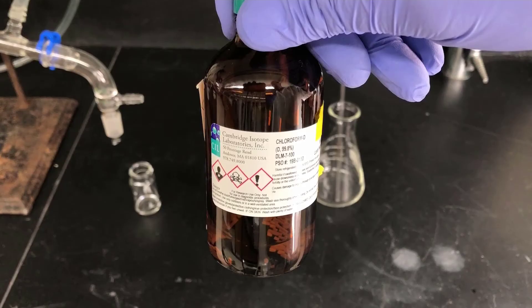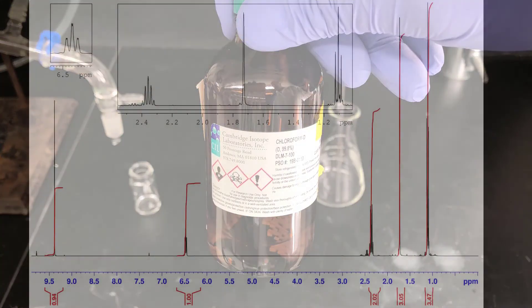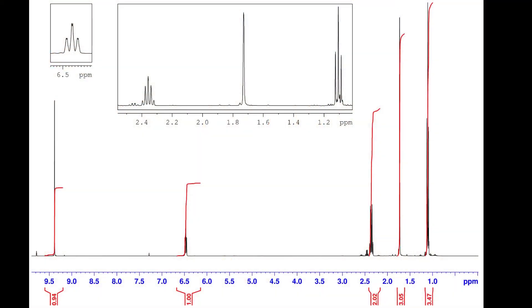Finally, I'll prepare a sample for proton NMR analysis by syringing in 0.6 milliliters of deuterochloroform into an NMR tube, then adding one drop of my product mixture, capping the tube, inverting it a couple of times, and writing my initials at the top in a Sharpie marker. Your NMR data will be acquired and sent to you by email, either as a PDF file or as a raw data file that you need to process in Bruker's TopSpin NMR processing program. Here's a high resolution image of a proton NMR spectrum of the product. You should interpret the peaks by drawing the structure of the product, showing all the protons, and drawing letters next to each proton corresponding to letters next to each signal. There's a very small amount of propanal that appears in this spectrum, so just be aware of those minor peaks.